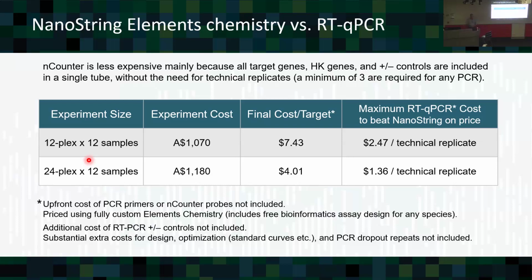But the point is elements was made so that they could uncouple the NanoString elements from the oligos. So you just make oligos. But that kind of means you can play around, right? What frustrates me is I've never seen anybody play around.